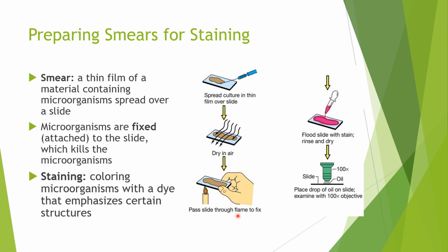You take your slide and you just pass it over a flame 2 to 3 times, very quickly, by the way. Very, very quickly, you pass it over the flame so that it can attach to the slide. And at the same time, the microorganisms are going to be killed along the way when you do that.